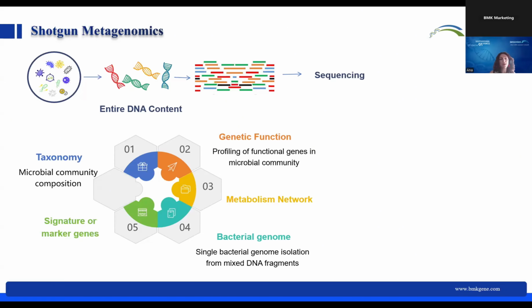And this includes looking at antibiotic resistance, heavy metal resistance, these kinds of marker genes that are often relevant in these studies. In some circumstances, it may also be possible or of interest to be able to isolate single bacterial genomes from this complex mixture that has bits of multiple genomes of bacteria, fungi, and everything else that is present there.